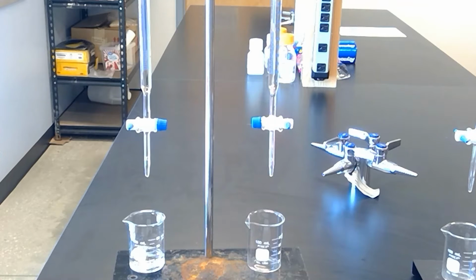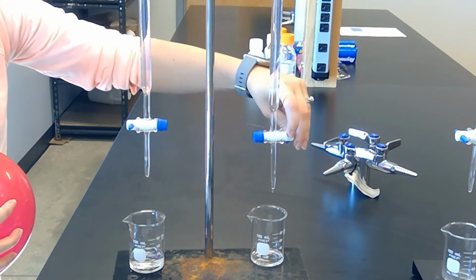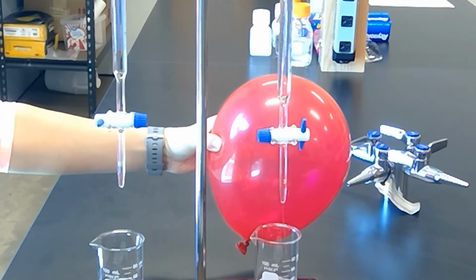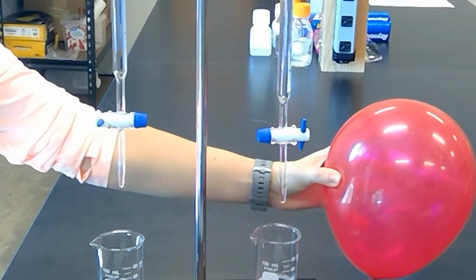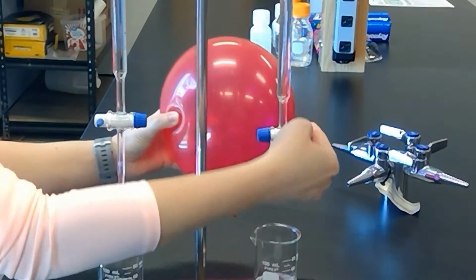We're going to test the same thing with acetic acid, aka vinegar. This is also a carboxyl functional group, which means that this smells putrid. I'm going to turn this on. Normal stream. Charge my balloon again. This also attracts towards the balloon. Do it in a different direction as well. Turn that off.